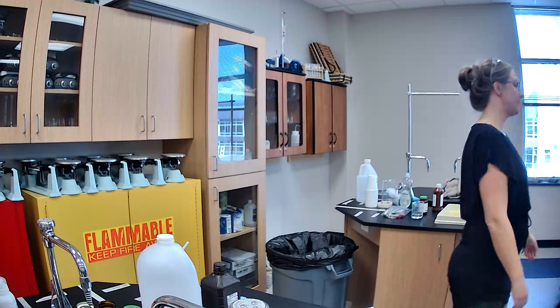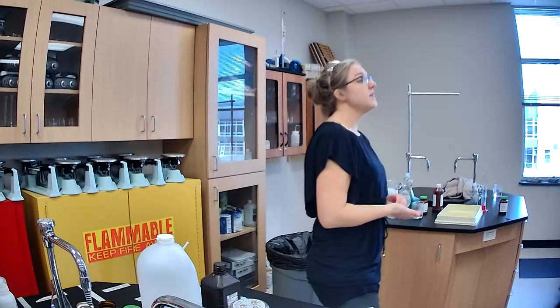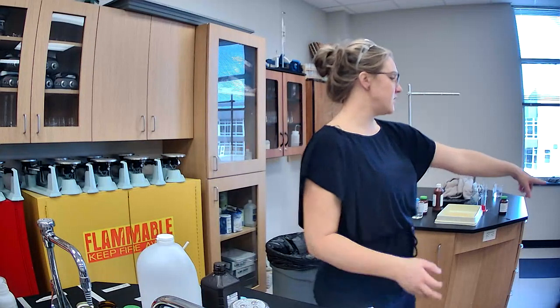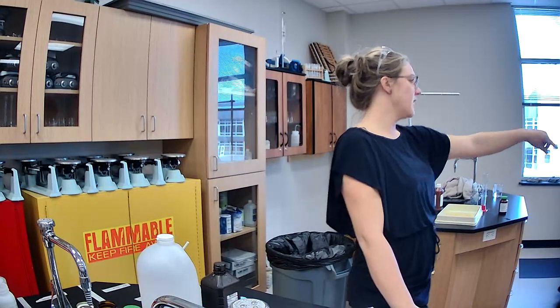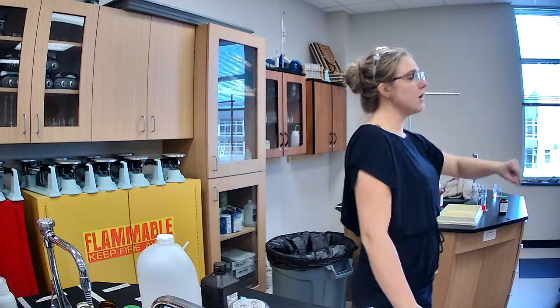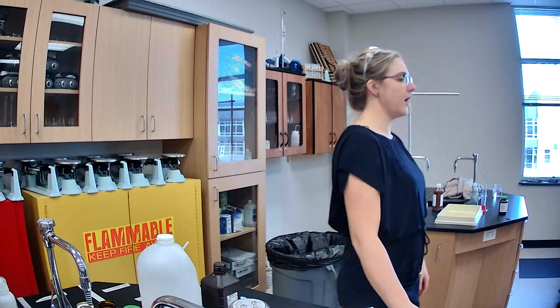Brian? Doesn't it take a very long time for metal and water to react to rust? Yes. So can you see, Luke, hold it up. You see how the water's turning orangish, kind of reddish? So the rusting is beginning to start, but it won't actually turn completely orange for a while.